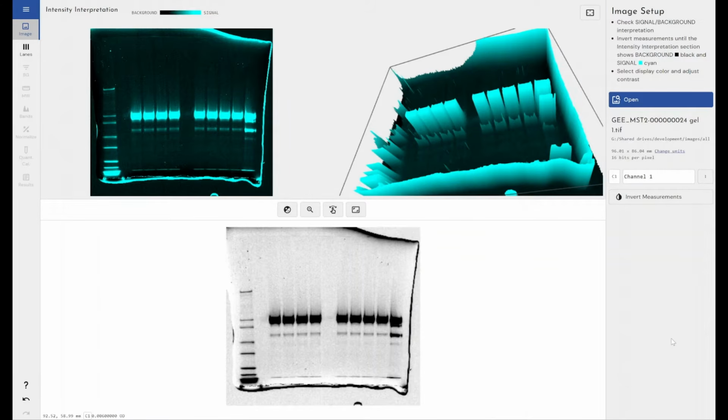The principle being that high molecular weight proteins or longer sequences, higher base pair number of DNA, RNA, will have a harder time moving through your gel and thus will appear higher up within your gel than lower molecular weight or smaller base pair sequences of DNA or RNA. The RF value is simply a function of how far has my protein, DNA, RNA moved as a function of how far it could have moved.